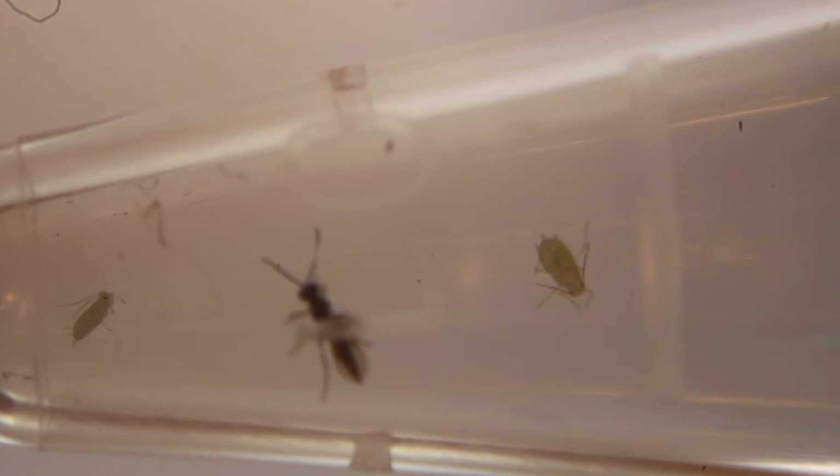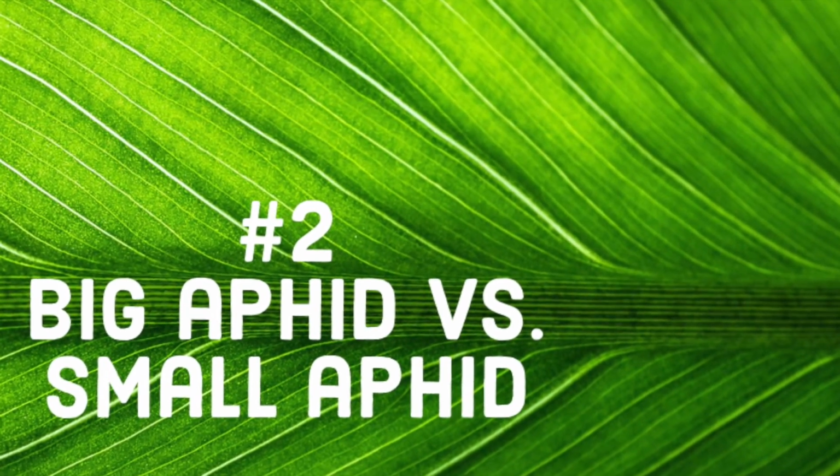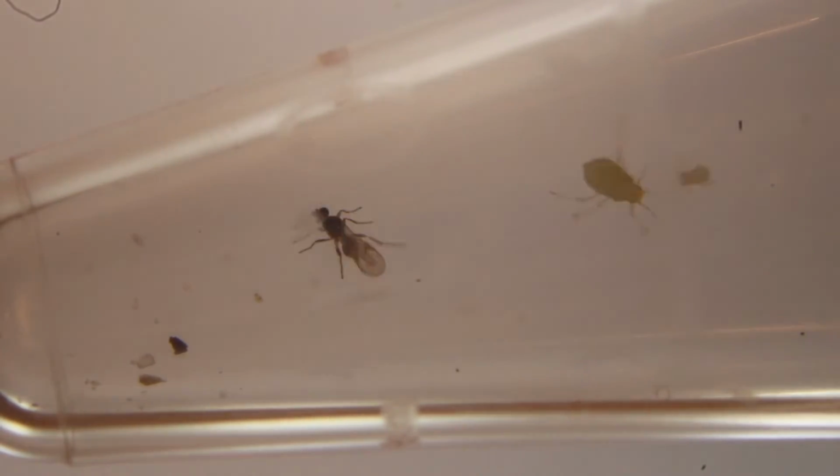After 5 minutes of exposure, this female chooses not to parasitize either of them. Here I give this new female Lysiphlebus 10 minutes to choose between a large aphid and a small aphid. I'm starting to feel like these ladies might be camera shy, because, spoiler alert, she doesn't parasitize either of them.